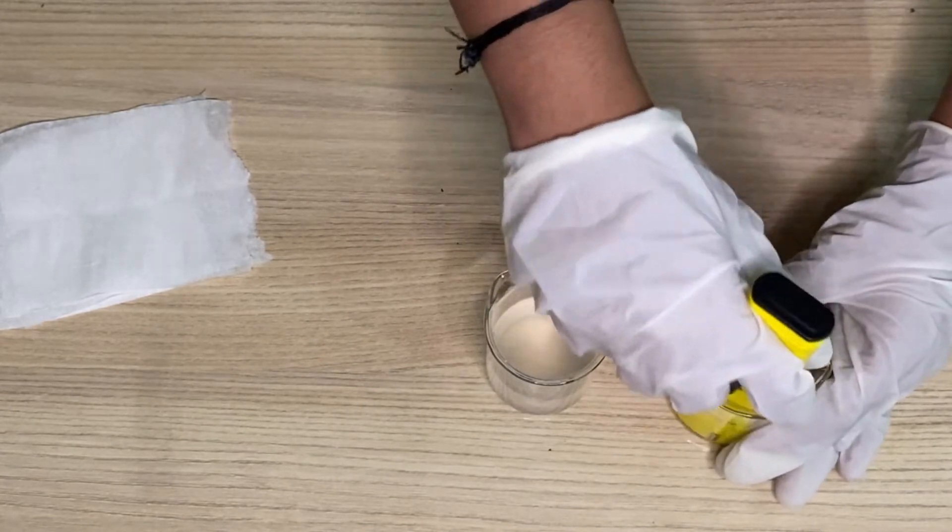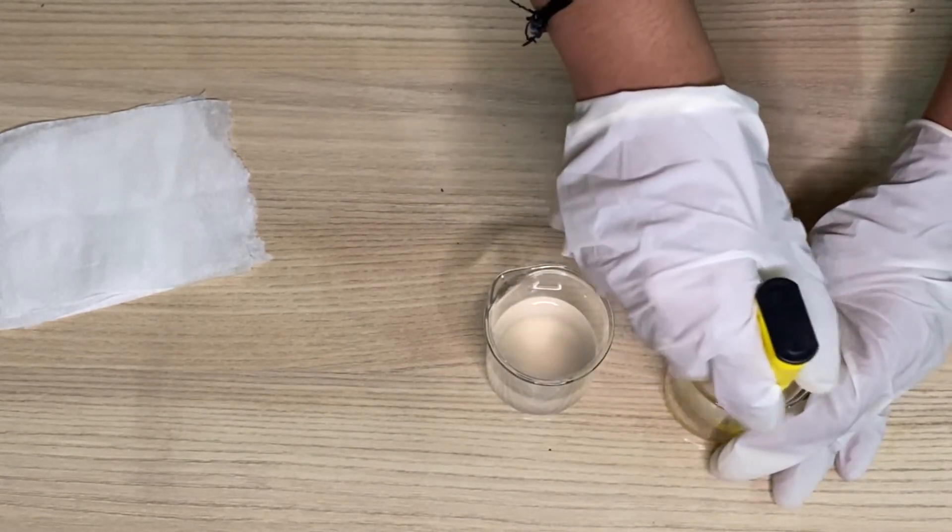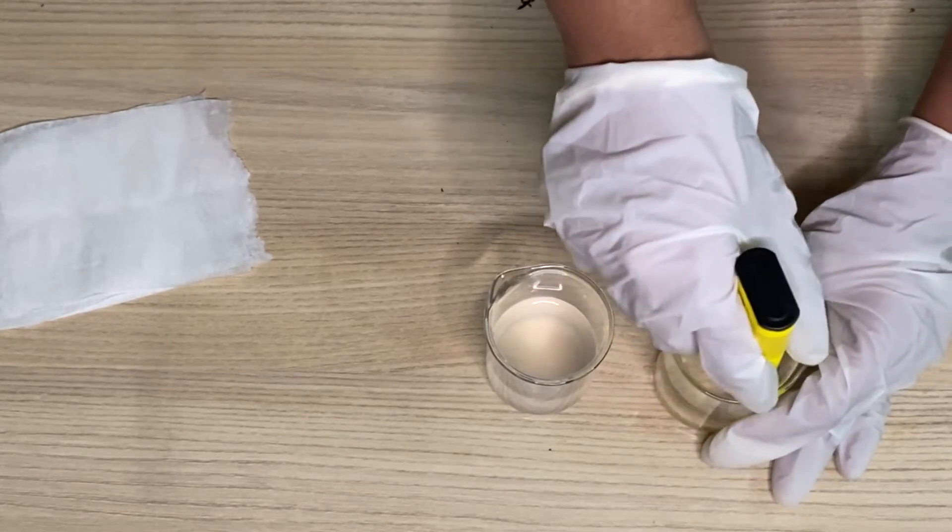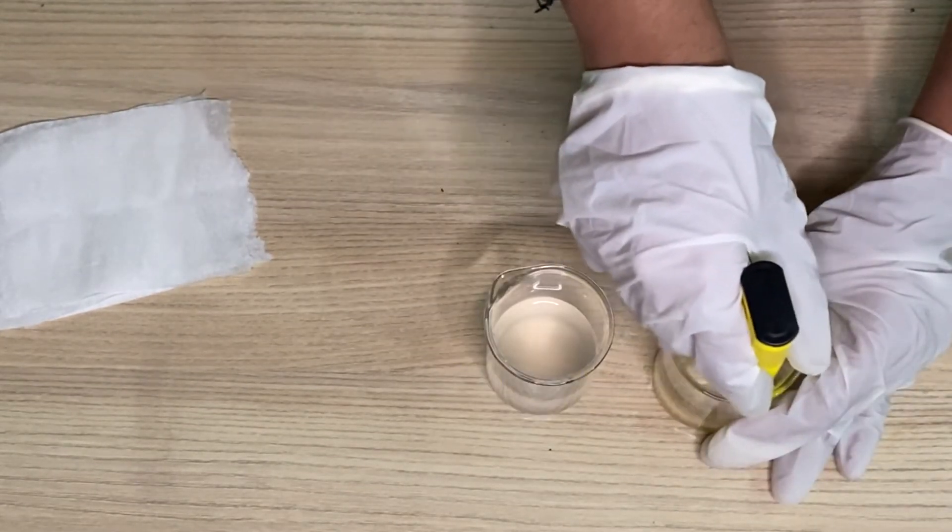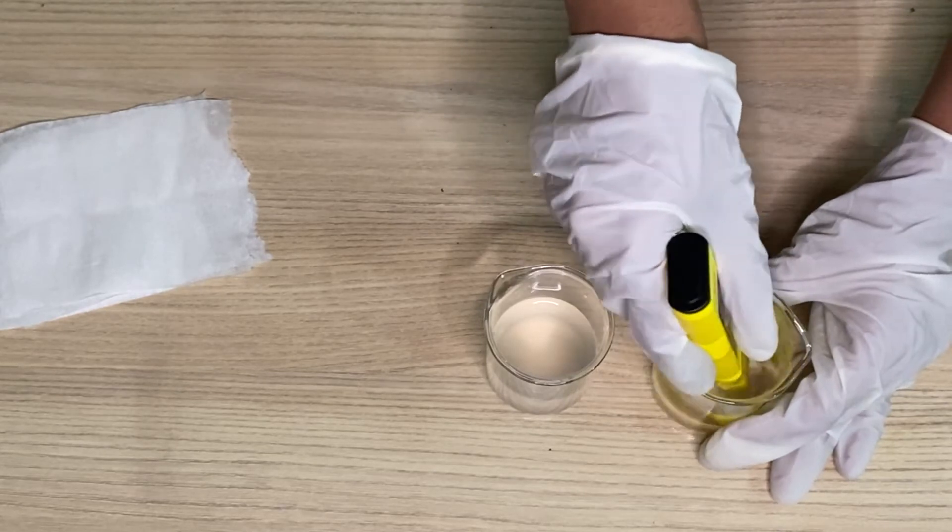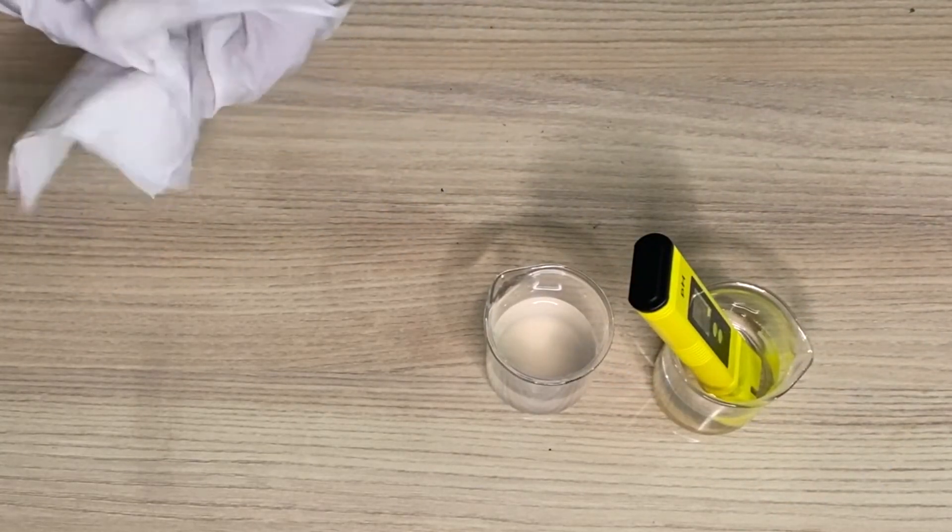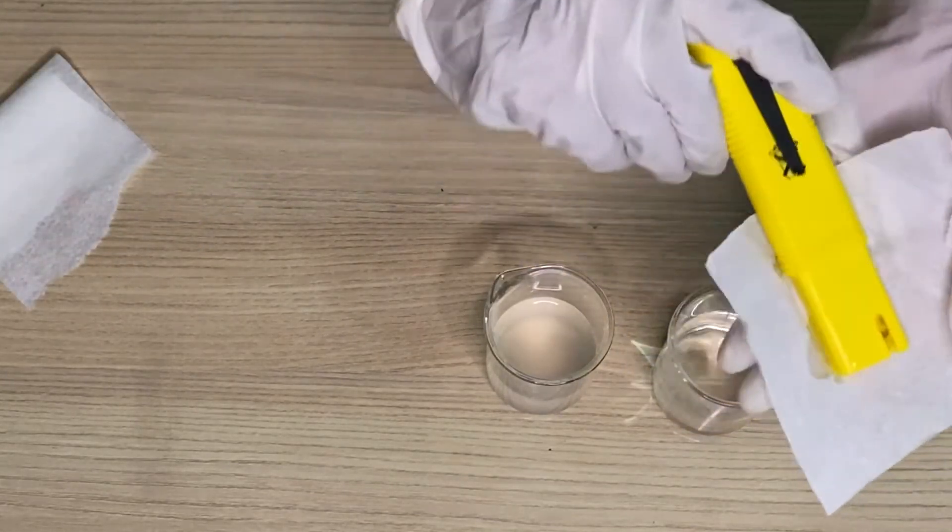Again put it in distilled water. Stir it gently. You don't want to break the glass inside the pH meter. And now again wipe it using a paper towel.